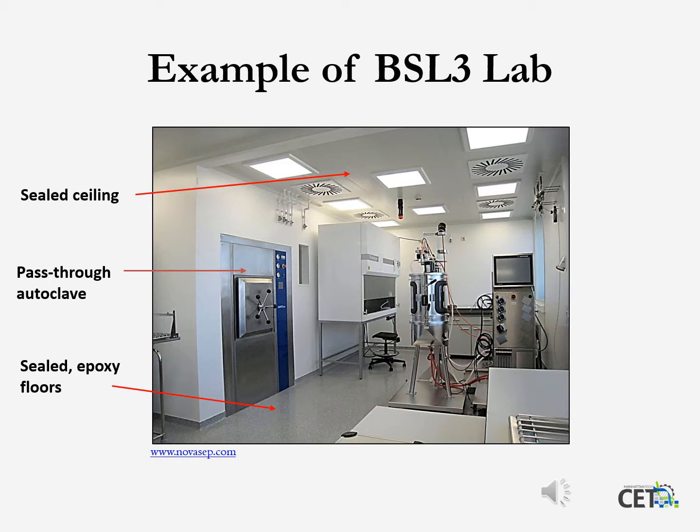This is a picture of a BSL 3 lab. The mechanical features of these rooms are stepped up quite a bit beyond those of a BSL 2. That's because the primary goal of this level of containment is keeping aerosols from spreading. If you remember, the primary route of contamination is by aerosolization of microorganisms. The microorganisms used in these labs will definitely cause disease and illness, but there are treatments for them.